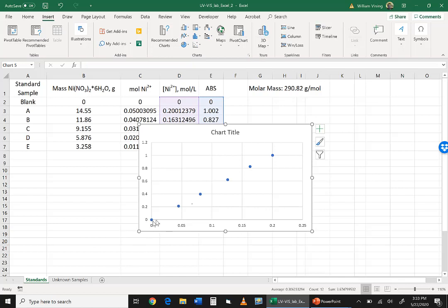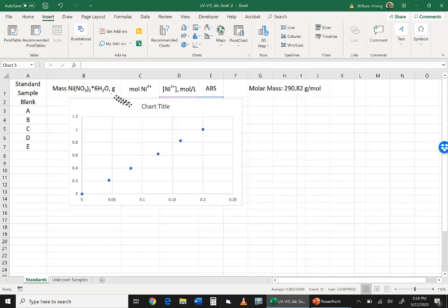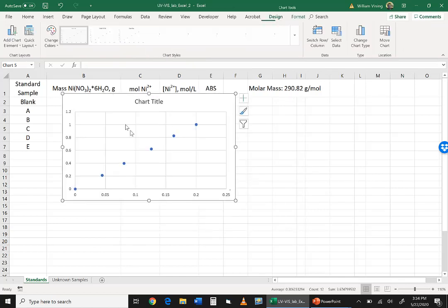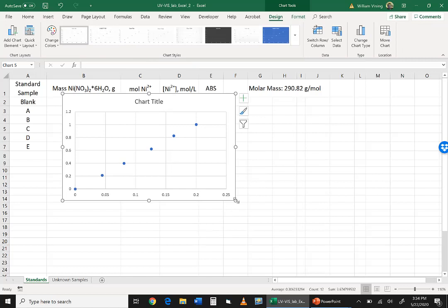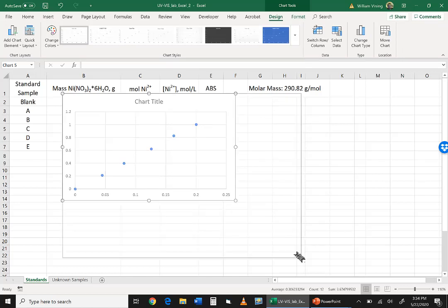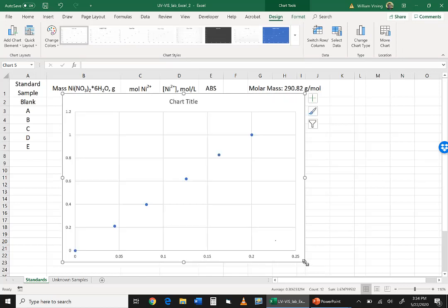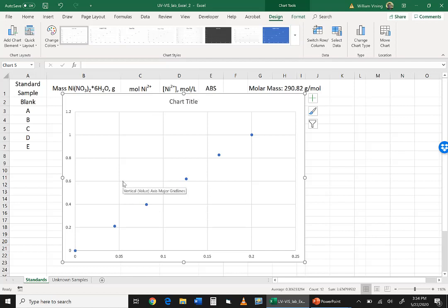It looks pretty good. It looks pretty linear. And so that's pretty nice that we came up with that. I'm going to make it bigger because that's the kind of star of the show. And now what we're going to do is we're going to, we have to spruce this up now. And so the first most important thing is to worry about the axes.